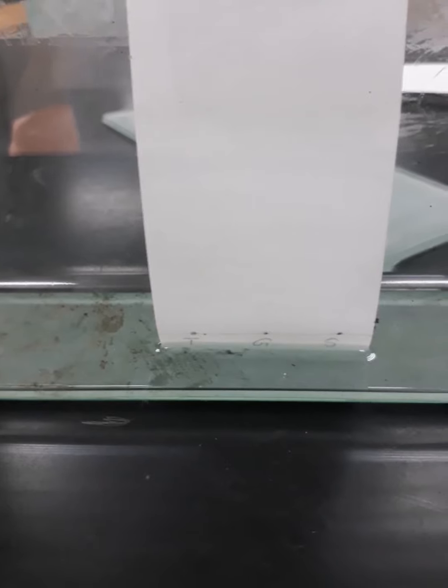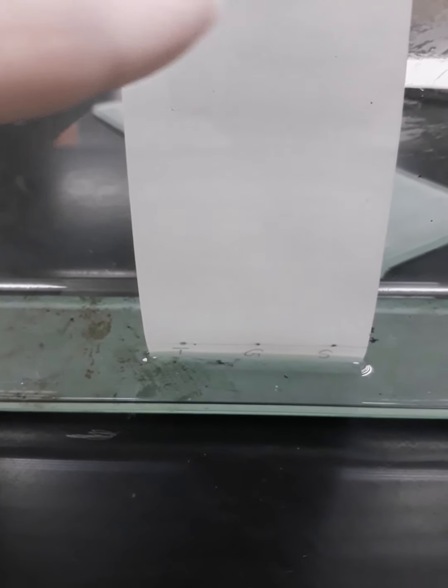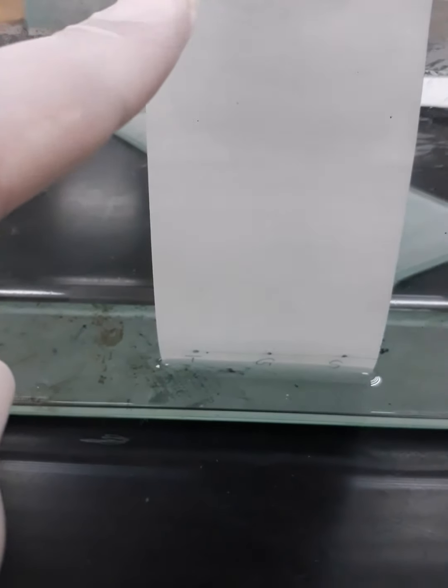Now 37 minutes have already passed, so we will find that the solvent moved up over the stationary phase and reached that level. So now we are going to remove the chromatographic paper, or the chromatogram, from the jar, and we will start to define the solvent front, which is the line between the dry and wet area, if you can see it here. Of course, we are going to mark that using the pencil.